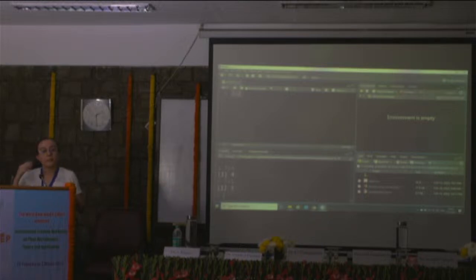And now we go to the panels in the right. These have multiple tabs, as you can see. I'm just going to explain the ones that we're going to be using, because honestly I only use those ones. I don't use everything when I do analysis. So this one over here is the environment. The environment has all the variables and all the data that you are saving in your session.